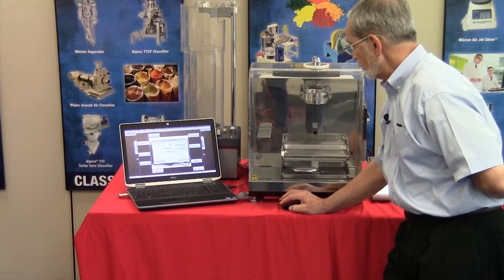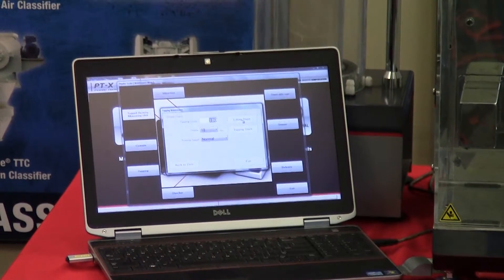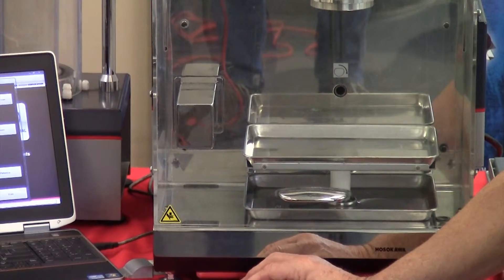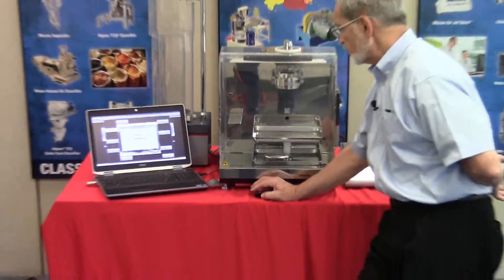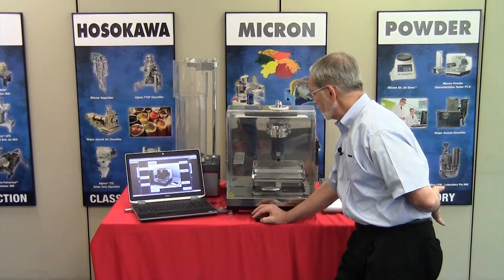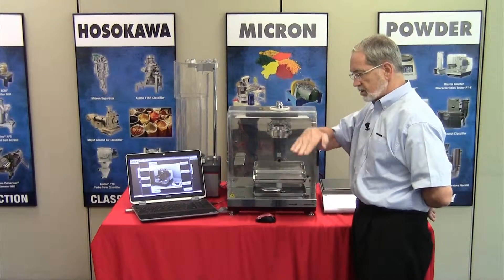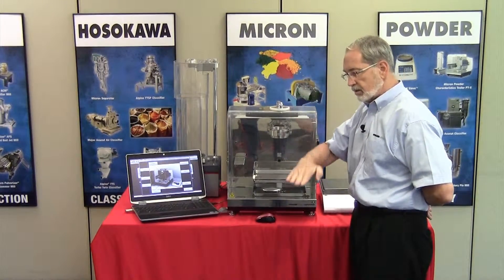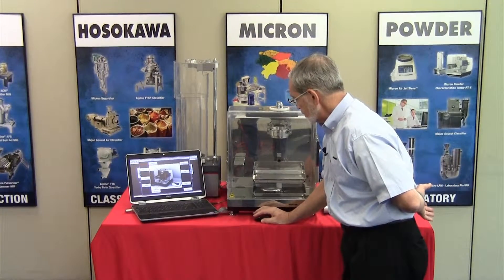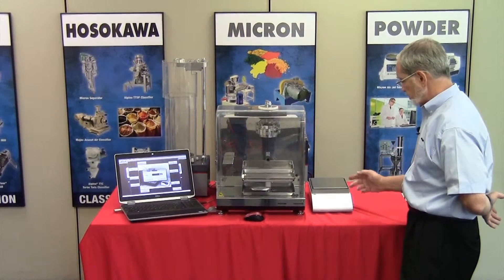Tapping — notice the platform has just elevated. Typically you would not use the platform to do this but just to simulate what takes place to confirm that all is functioning properly. Then we have the shocker, which you cannot see. There's an internal mechanism here that elevates a consistent weight and drops it from a specific height. The balance — we can come over and confirm communication with the balance.